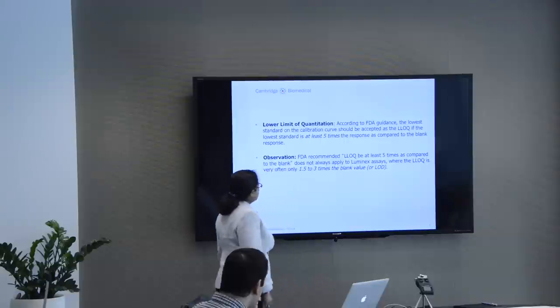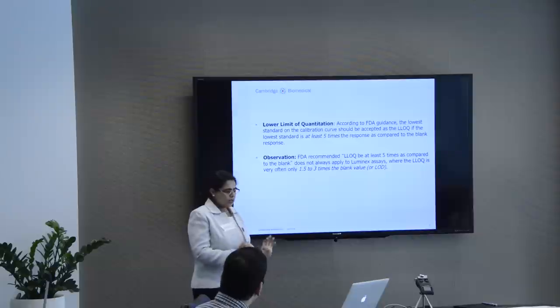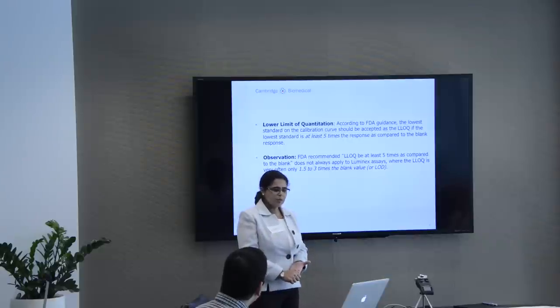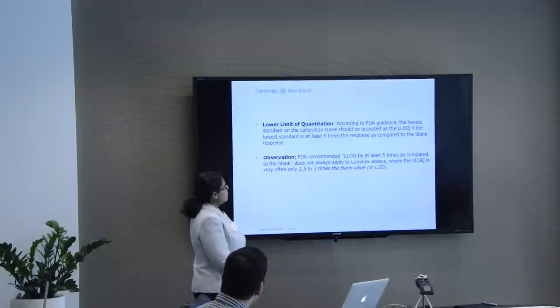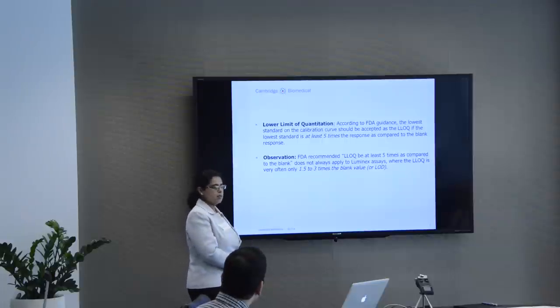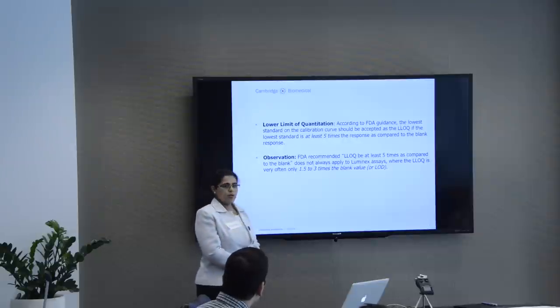So let's talk about lower limit of quantitation. According to FDA, the lowest standard on the calibration curve should be accepted as the lower limit of quantitation if the lowest standard is at least 5 times the response as compared to the blank response. And this is what we have observed, that this FDA recommended lower limit of quantitation at least 5 times as compared to the blank does not always apply to the Luminex assays. And what we have observed is that most of the times, if not all, it's only 1.5 to 3 times the blank value or the limit of detection.